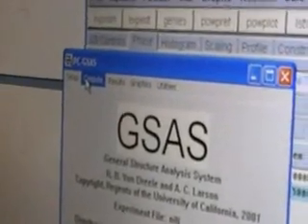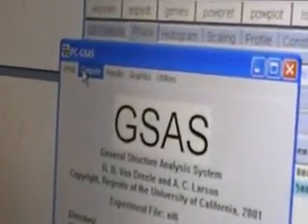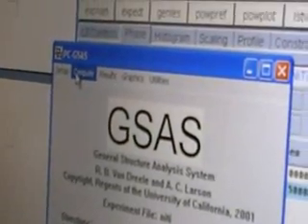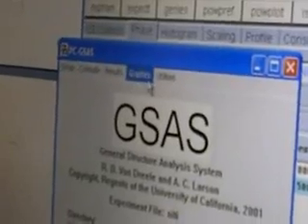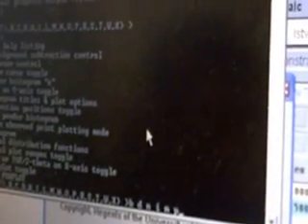And The next one What is parameter? Similar refining, similar refining. Let's just go power plot. And have a look, right? Have a look. How the refine Yeah. Different pattern looks like. See? Do you want to save? No. No. Here, I always use BDNNIP. BDNNIP. Okay. This one gives the If you The The detailed meaning, you can see from here. Yeah. Let me Let me go. And give you this screen, so you will know what is the meaning for BDNIP. But this one can give you the optimal output. Optimum in a sense, you can see much more clearly BDNNP.